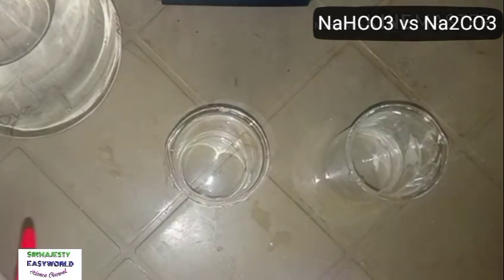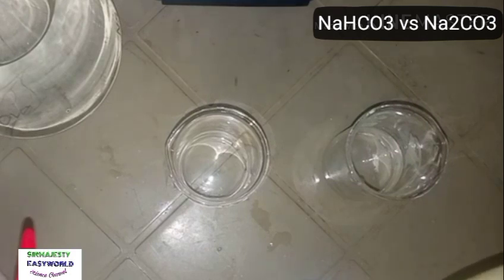Then I will use litmus paper, and also I will use phenolphthalein. Apart from the action of heat, litmus paper can still distinguish between these two, the bicarbonates. This is actually for the teachers. As we know, they are bases, of course. A base should turn red litmus paper blue. Though the other one is an acid salt, it has this basic property a bit. So I'm going to bring red litmus and see the rate at which the two will turn it blue.